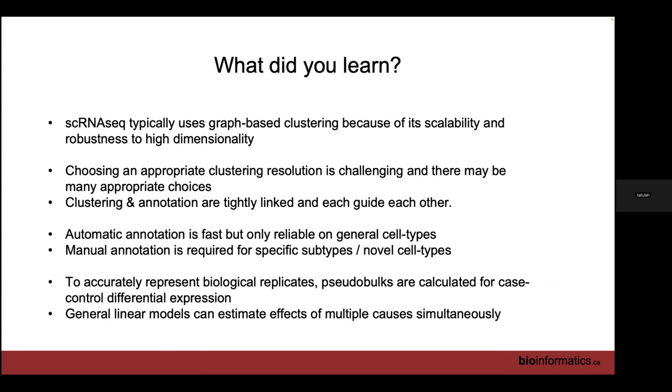And to accurately represent biological replicates, when you're doing differential expression, you can use pseudo bulks, or you can use general linear mixed models.